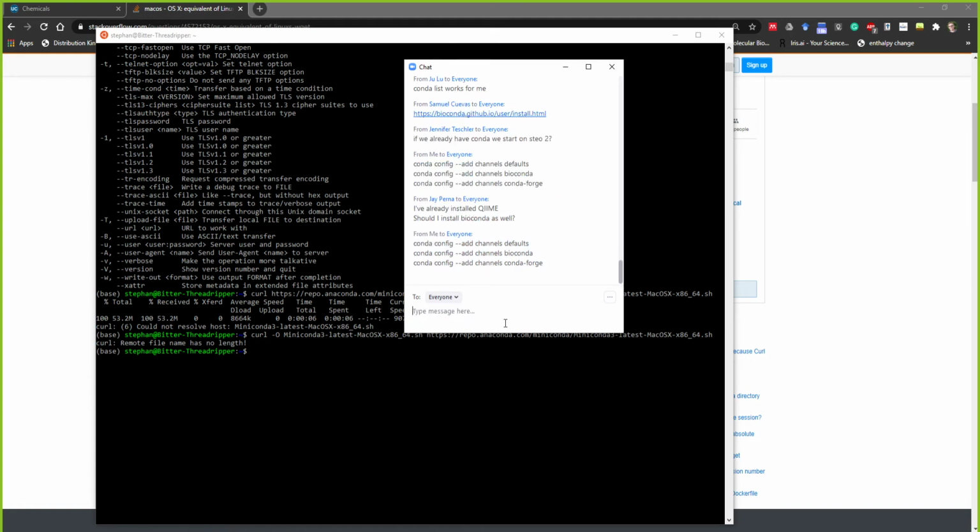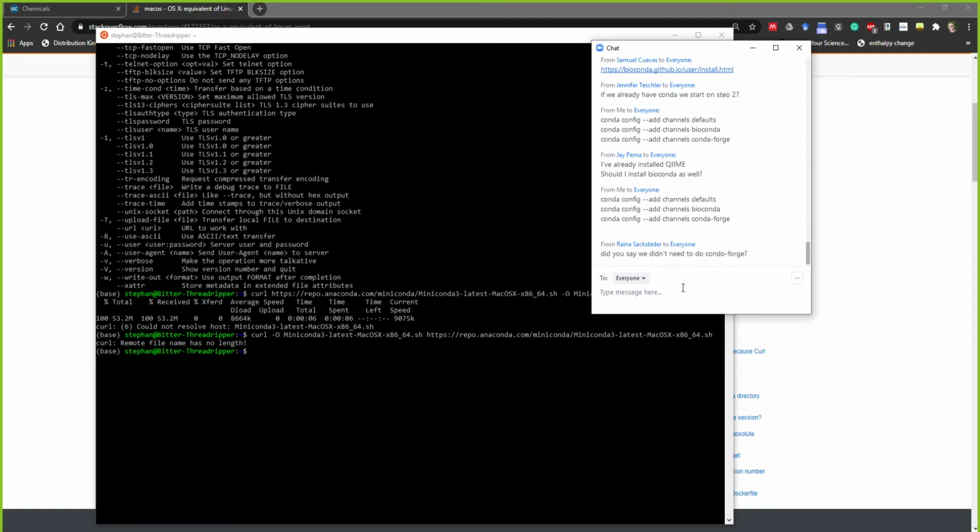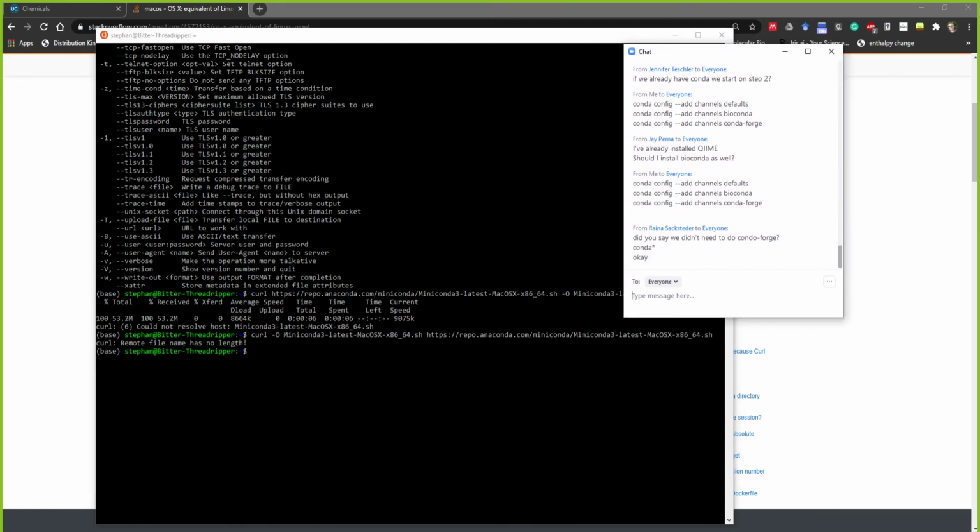Maybe you have to explain why they need BioConda. BioConda is a place where we're going to be able to download other programs that are useful for doing this kind of work. It isn't 100% required, but I'd recommend it if you're going to be doing more work along these lines. For installing that, should I install it in the QIIME environment, or in my root environment? You don't need to do conda-forge. I would do it in the root, so I would just exit that terminal, start a new one because it's going to be easy to get in there, and just run these 3 commands. Or 2.